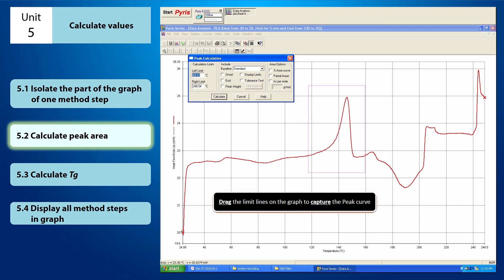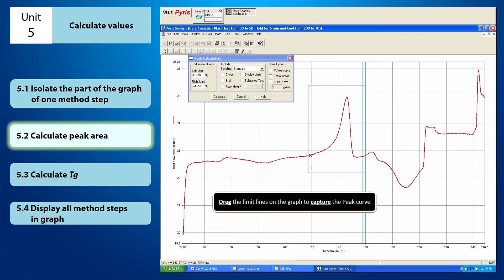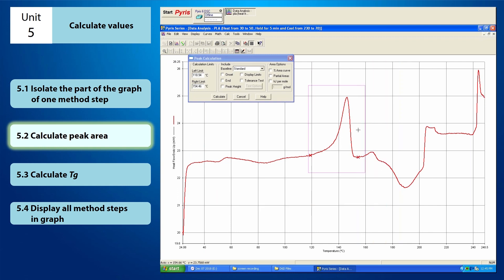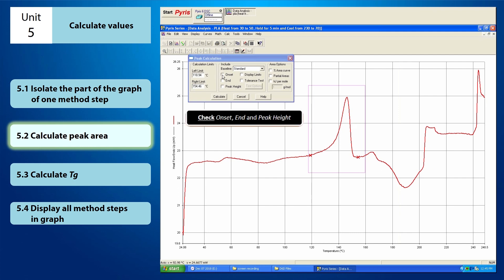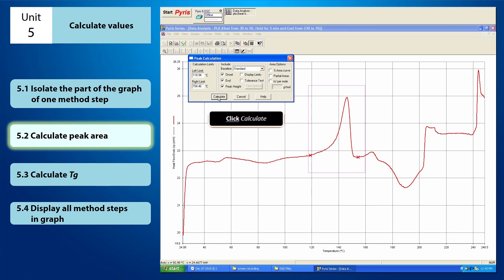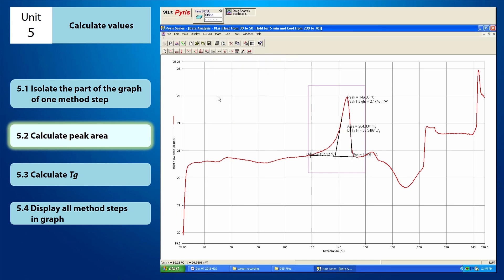First, you need to drag the limit lines on the graph in order to capture the peak curve. Once you have captured the peak curve, on the peak calculation window, check the Onset, End, and Peak Height boxes. Then you can just click Calculate. The values of the calculation will appear nearby the peak area.